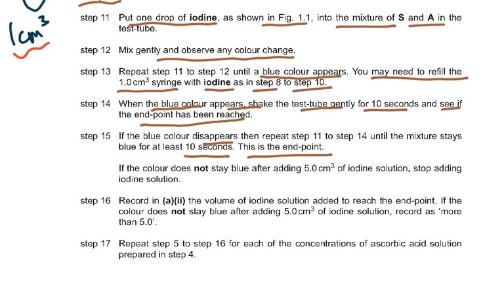Now, what you need to do is do this very calmly because nobody is watching you. The video doesn't go to Cambridge. It's only your paper script which goes to Cambridge. So whether you do it correctly or not, it's immaterial, but don't become nervous or agitated. If the color does not stay blue after adding 5 centimeter cube of iodine solution, stop adding iodine solution.